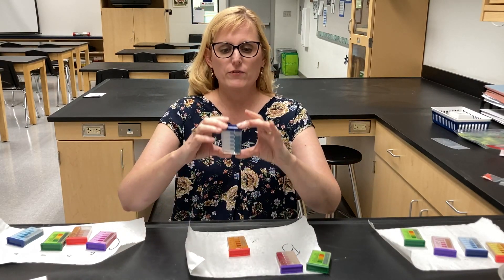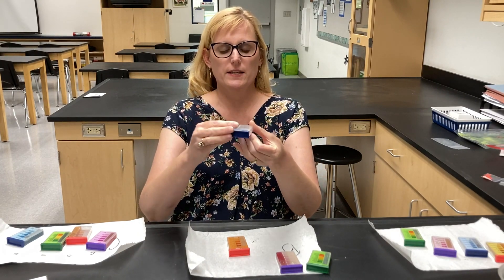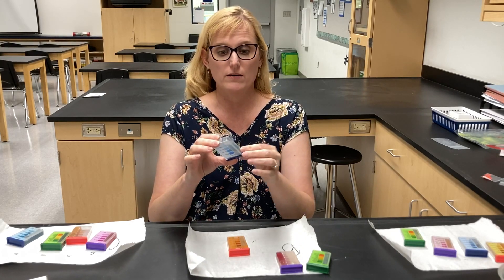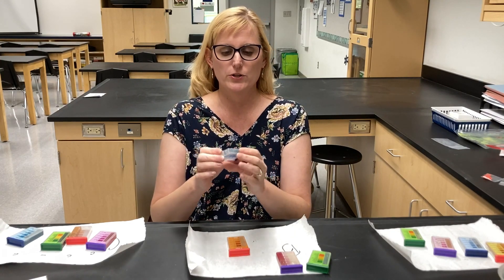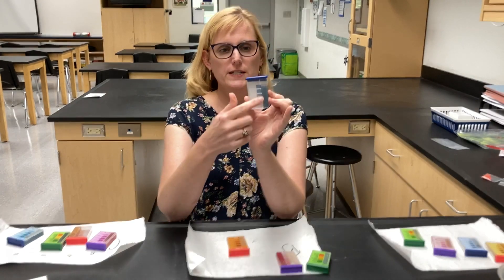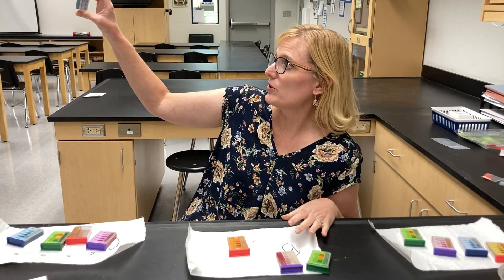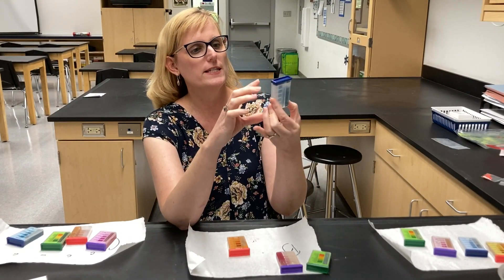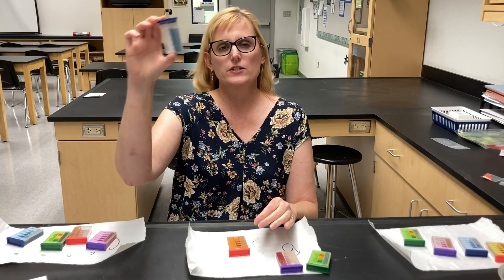Then we have phosphorus. I like to shake it up a little bit more because the phosphorus reagents don't like to dissolve very well, so I'm going to let it dissolve a little bit. This phosphorus is a nice blue color but it's not terribly blue, so I would say it's adequate — it could be close to sufficient but I think it's more adequate.